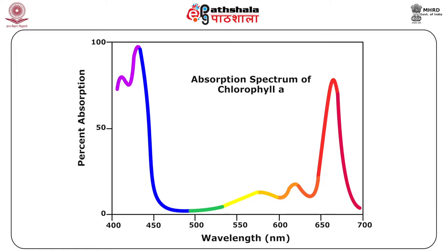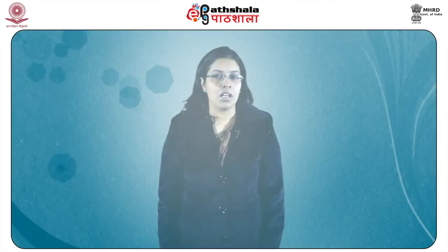This is again the figure which shows the UV visible absorption spectrum for chlorophyll, the absorption spectrum of chlorophyll A to be precise. Chlorophyll absorbs so strongly that it can mask other less intense colors. Some of these more delicate colors from molecules such as carotene and quercetin are revealed when the chlorophyll molecule decays in the autumn and the woodlands turn red, orange and golden brown.